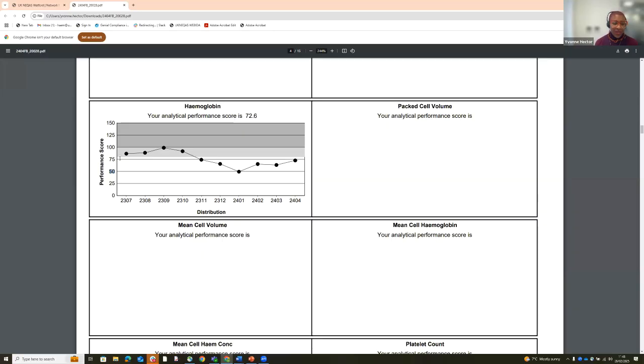So when you're hitting into these gray areas, the lighter gray, as we said earlier, around 80, that's when I'd start to be concerned and want to look at what's going on before I get into the 100 and above. Also, you see this is trending downwards. If it was trending the other way and going at a trajectory for multiple surveys, I would then start to be looking at that, even before it gets to around the 80 mark.